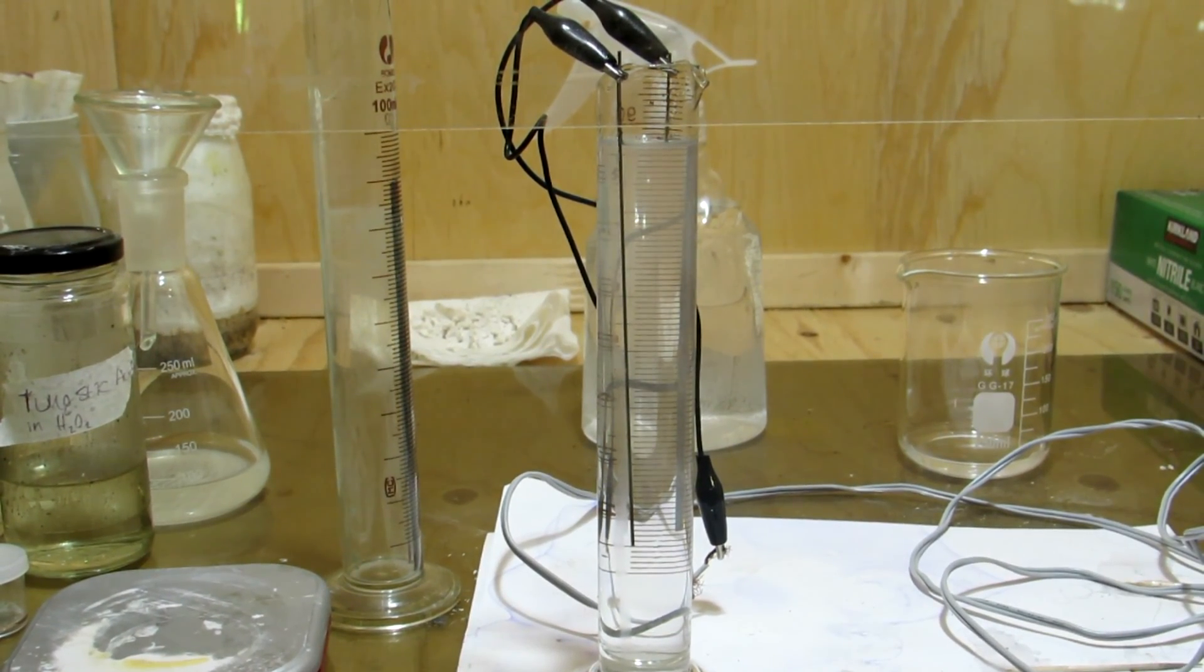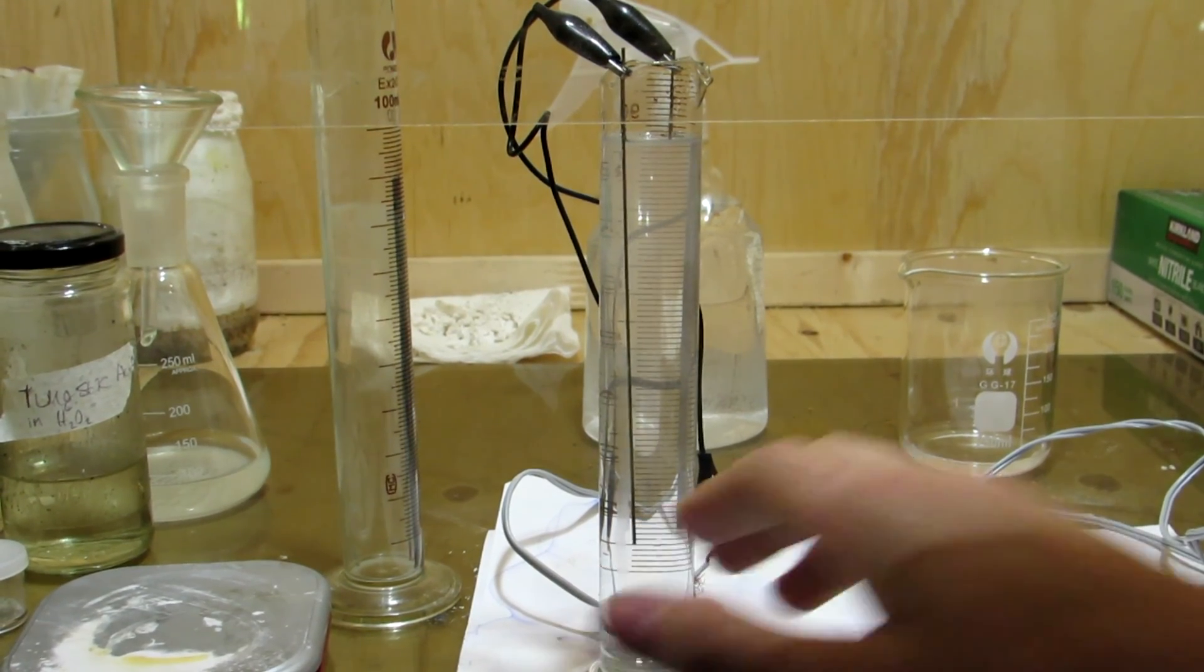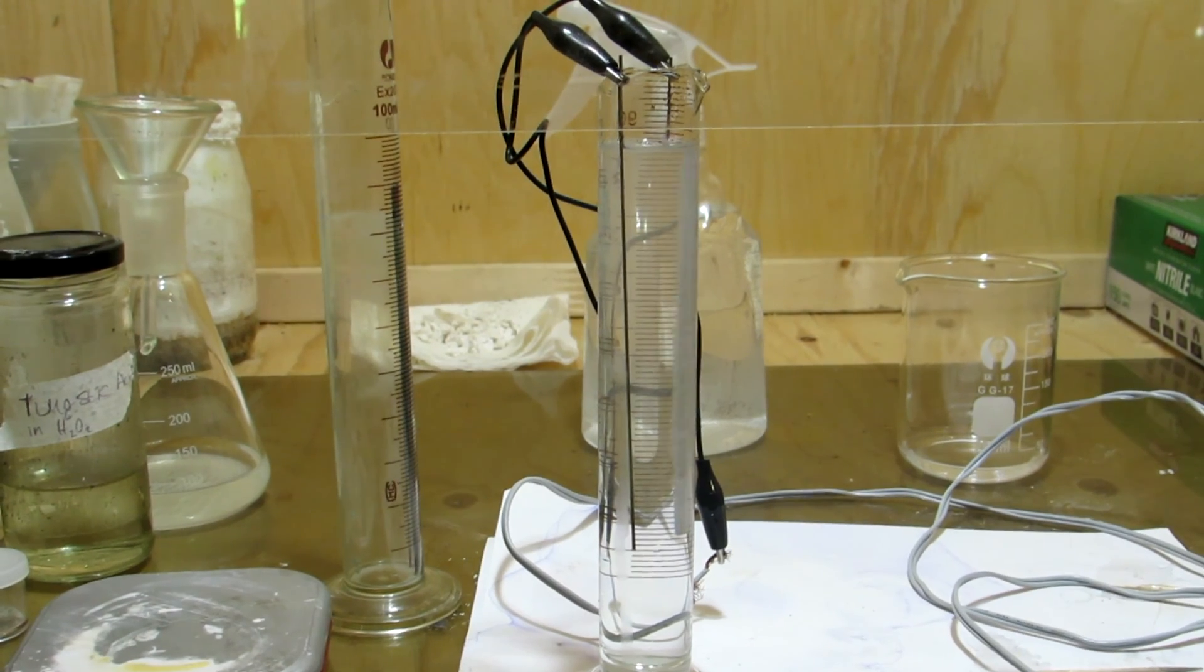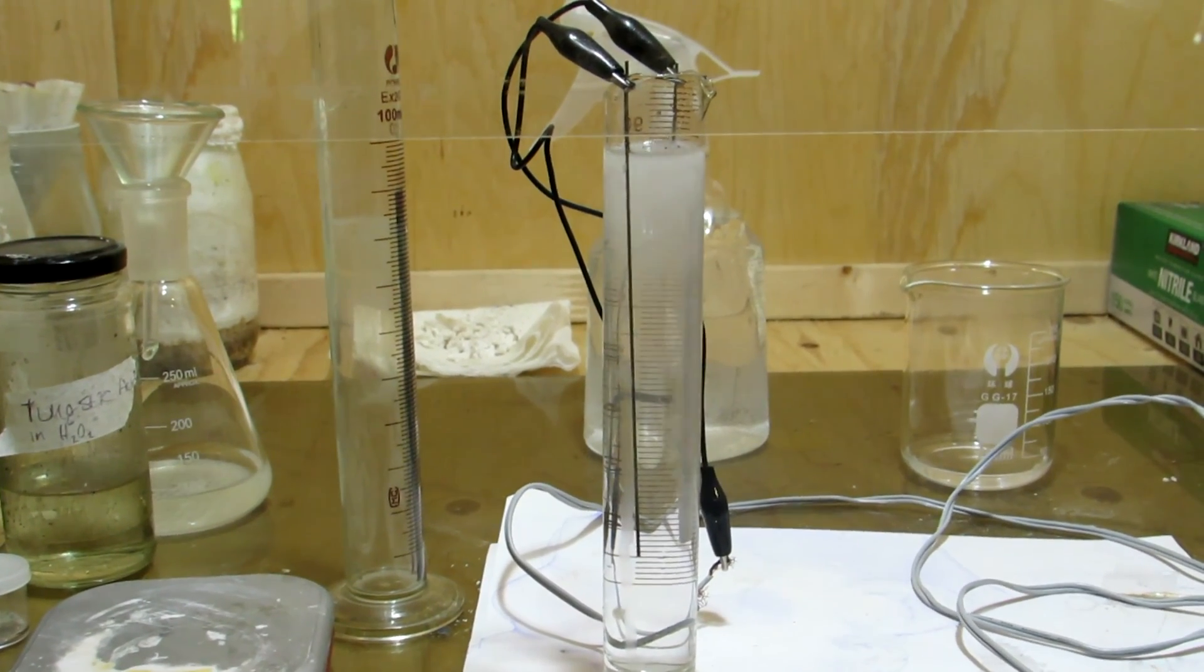20 grams of sodium hydroxide dissolved in 100 milliliters of water is then added to the graduated cylinder. The other ends of the alligator clips are attached to a 5 volt DC power supply to begin the dissolution.